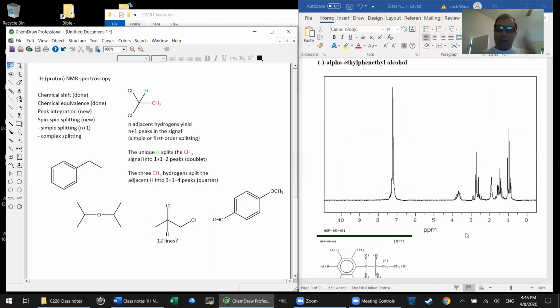What will happen is I'll make some compound, I'll go get the proton NMR spectrum, and I'll look, and it'll just be awful, just much worse than I expected. And I'm thinking, what's going on here? Is my compound not clean? I would have expected the spectrum to be much simpler than this. And then I look more carefully at the structure and I say, oh crap, these 2 sets of hydrogens are diastereotopic. So the splitting and chemical shifts are much more complex than I would have expected.